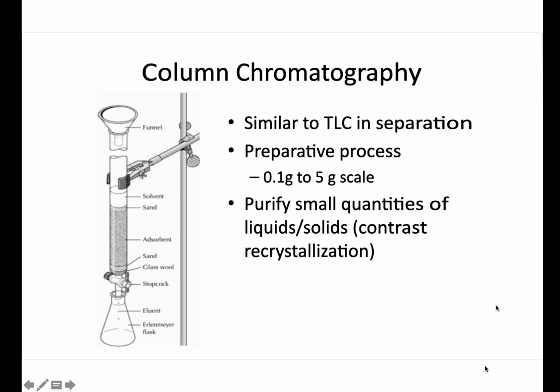Also, at the top of the silica powder, we cover it with a little bit of sand. Why? It's heavier. When we add the mobile phase, it doesn't allow the stationary phase to move, because any disruption or distortion in the stationary phase affects the rate of the separation, and it causes tailing. Tailing is something we don't want. We will discuss it later.